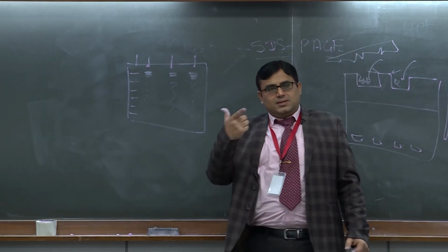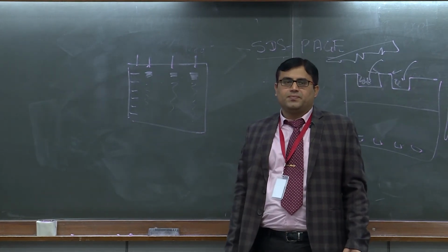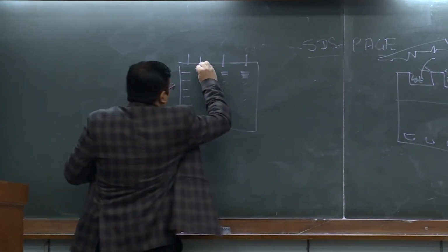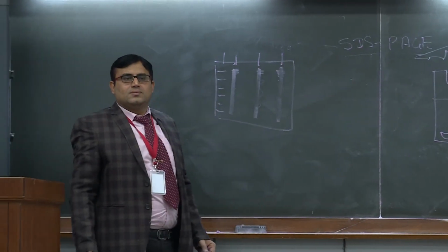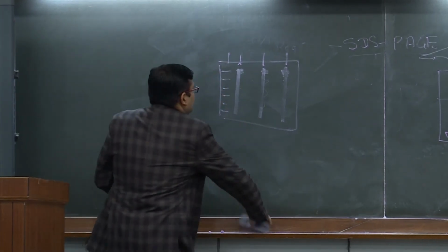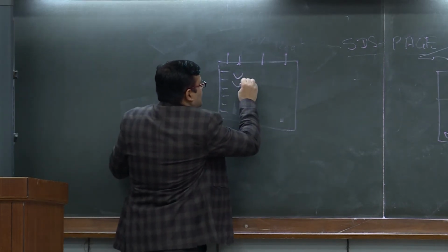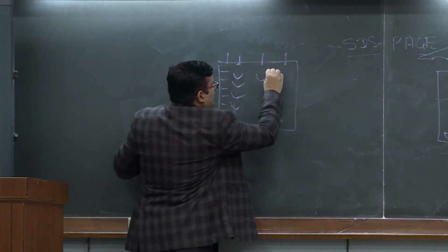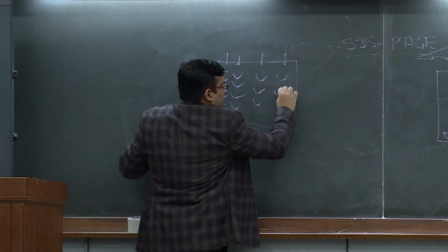Yes, the reason is the protein which you have used is degraded, right? Or you will get protein like this, partially degraded, or you will get protein like this. What may be the reason?